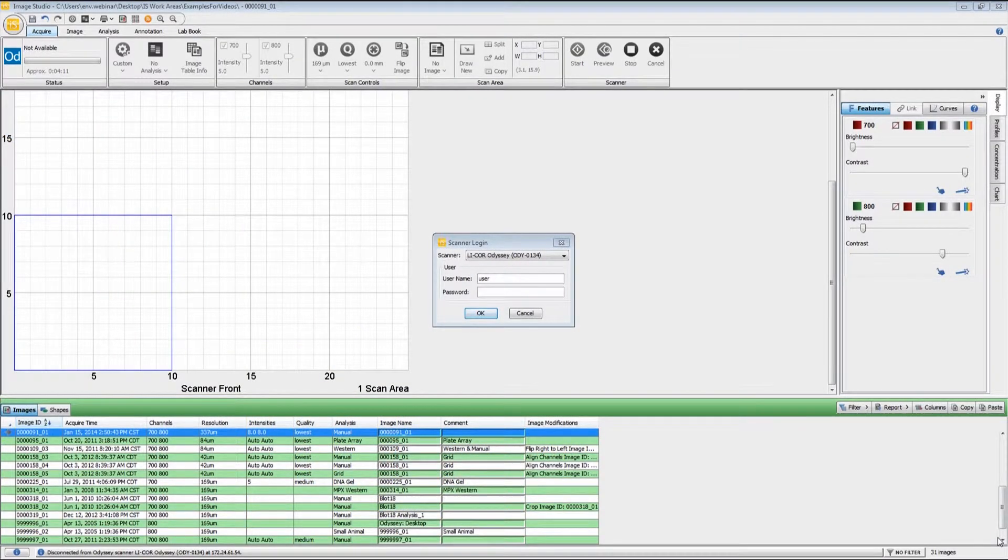In this video, I'll be taking you through the process of image acquisition for the Odyssey Classic infrared imaging system.